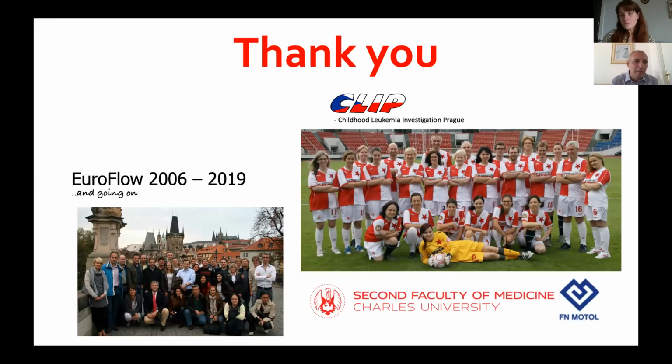It's a glass that is half full and half empty. If you want to find arguments that one particular newer instrument is way better than the others, you will definitely find a few data points that clearly show that this is much better. If you want to claim that you can pretty much transfer any assay from one to another, and that's fine, you can also find examples of that.